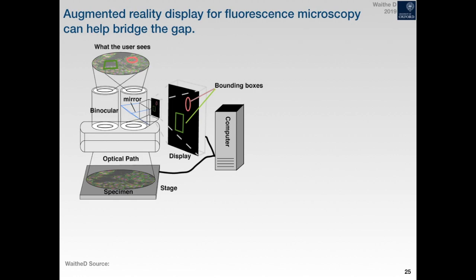But that's virtual reality, this is augmented reality. So what we did is we designed a system whereby we can overlay graphics as we're looking down the objective of the microscope. You're seeing your sample like on a normal microscope, but what you're seeing is annotated with graphics. We're not looking at a computer screen, we're actually seeing our sample, and a screen is being overlaid like a ghost image as we look down.